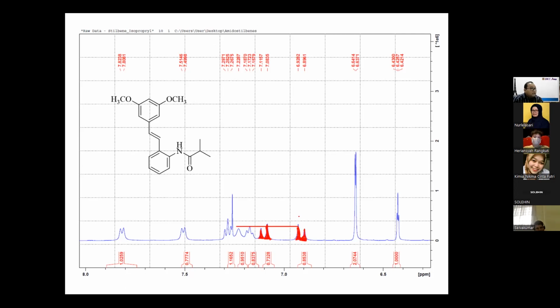And you can calculate the J coupling. For example, if we take a calculator here, so I have the calculator in my hand. Okay, take the value here: 6.9282 minus 6.8961, times 500 megahertz, if I'm not mistaken, it's 16 hertz. It's 16.1 hertz. Normally we call it 16 hertz.